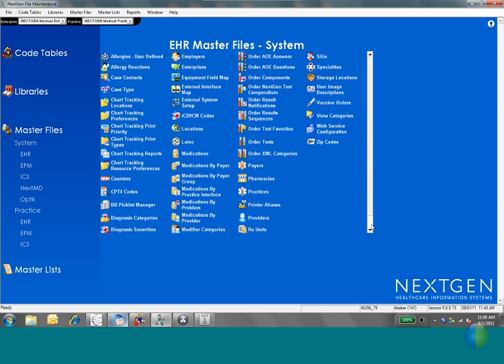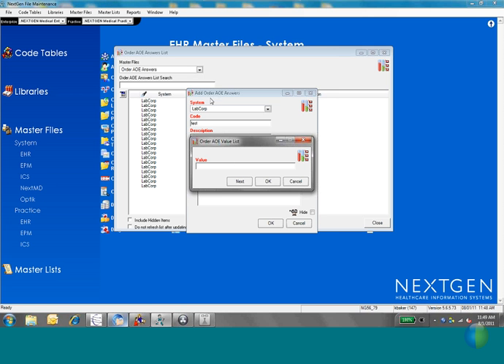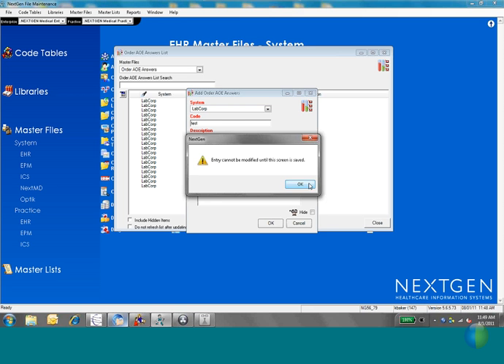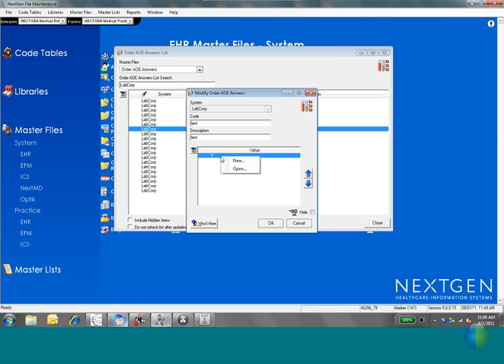Okay, and while I'm waiting for that, we'll go ahead and move forward. Oh, you said you created Y for yes, then decided to use yes, now cannot delete Y. Well, let's test your thing here. So, you decided to do Y, and then you wanted to go back. So, did you notice that pop up there? Did you already save the screen? You might want to click OK and go back to it and see if you can modify it. You should just be able to type in yes in place of it, or whatever you needed it to be. So you don't necessarily have to delete it, but you can modify it.